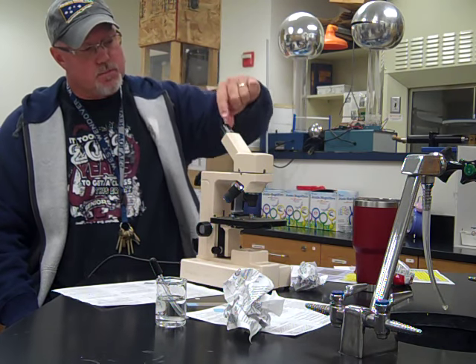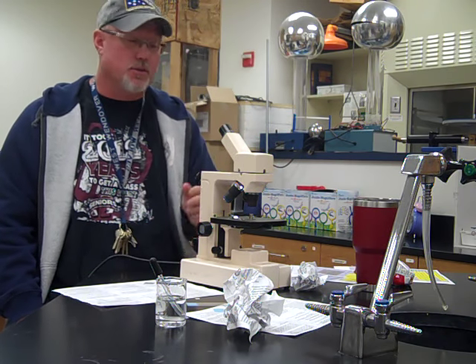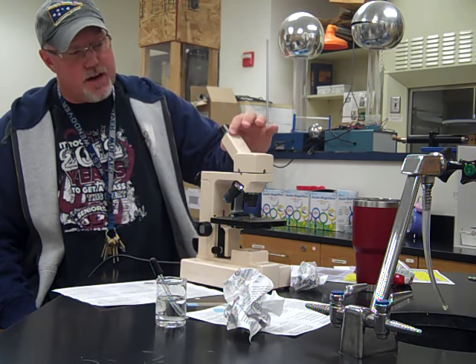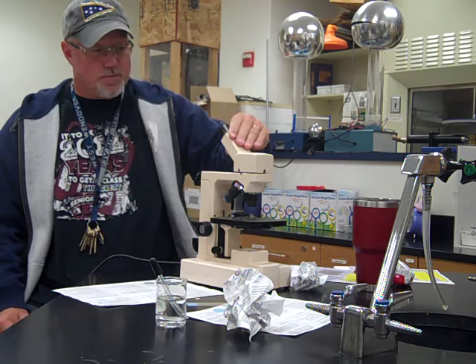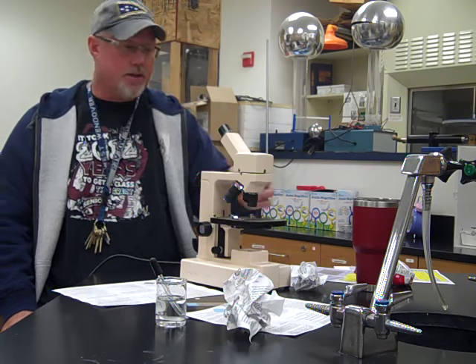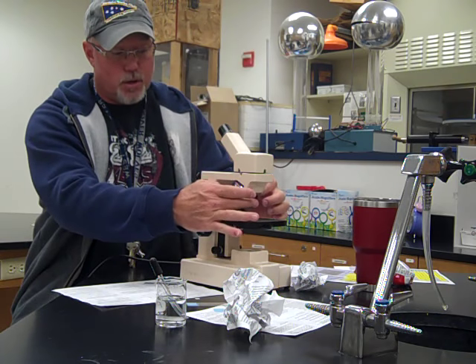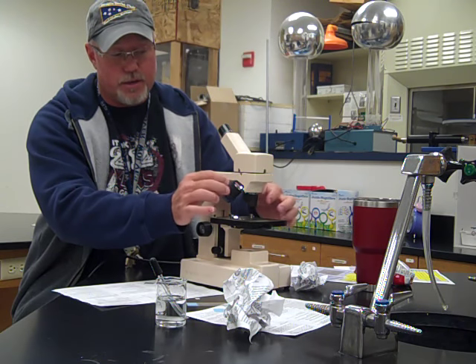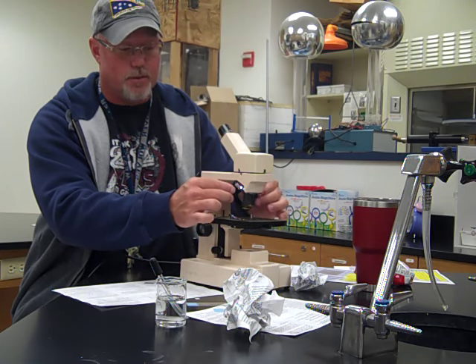Starting at the top, what you look through helps you see the object on the slide that you're going to be looking at. This is what we call the ocular. Attached to the ocular is the body tube, which is the spacing between the eyepiece and the next part, the nose piece. The nose piece holds what we call our objectives, and it also rotates. You'll hear a click, and they'll sit in there pretty good when you rotate the objectives around.